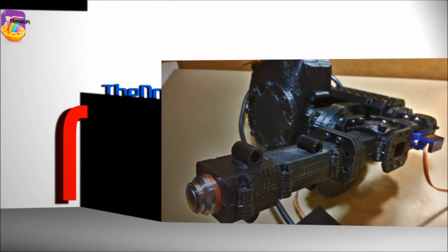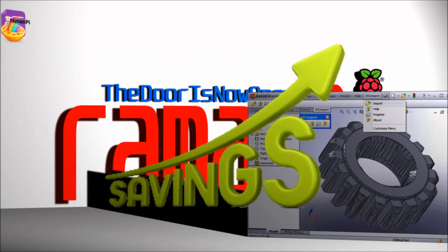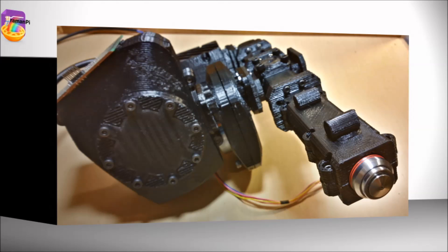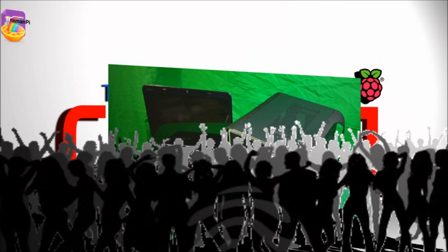I also made sure the design was physically sturdy and would withstand the test of time. I kept the parts modular, simple, and in a format that's commonly used in the industry. The individual parts are easy to work with and the overall cost is unbelievably low in comparison to the alternative. This is a one-of-a-kind system and the only do-it-yourself Raman spectrometer design available, let alone open source. I have received a lot of positive feedback from many people who have tried to create a Raman system themselves with no success.